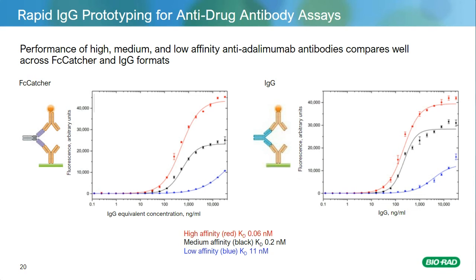On the subject of affinity, it's also worth mentioning one of the benefits of SpyTag is that we can work with the antibodies all the way through the generation in the monovalent format. So we get really nice, clean affinity signals if we're doing things like K-off ranking or affinity measurement. But one of the downsides of working with monovalent formats, although you get nice, clean affinity measurements and you can select highest affinity binders, is that the monovalent format itself is a low avidity format.